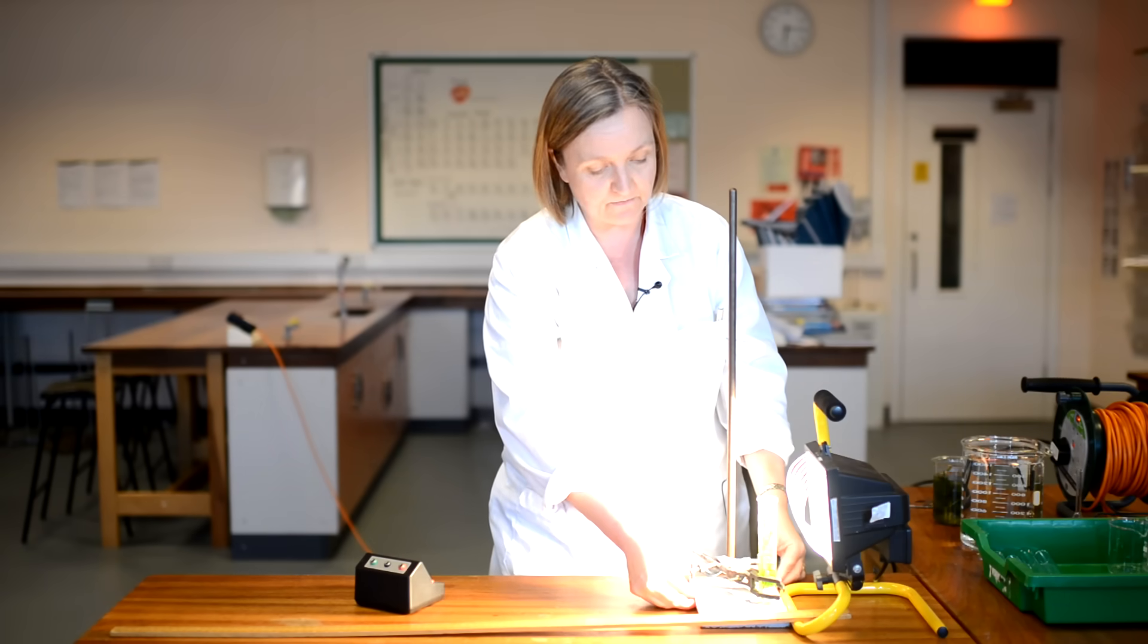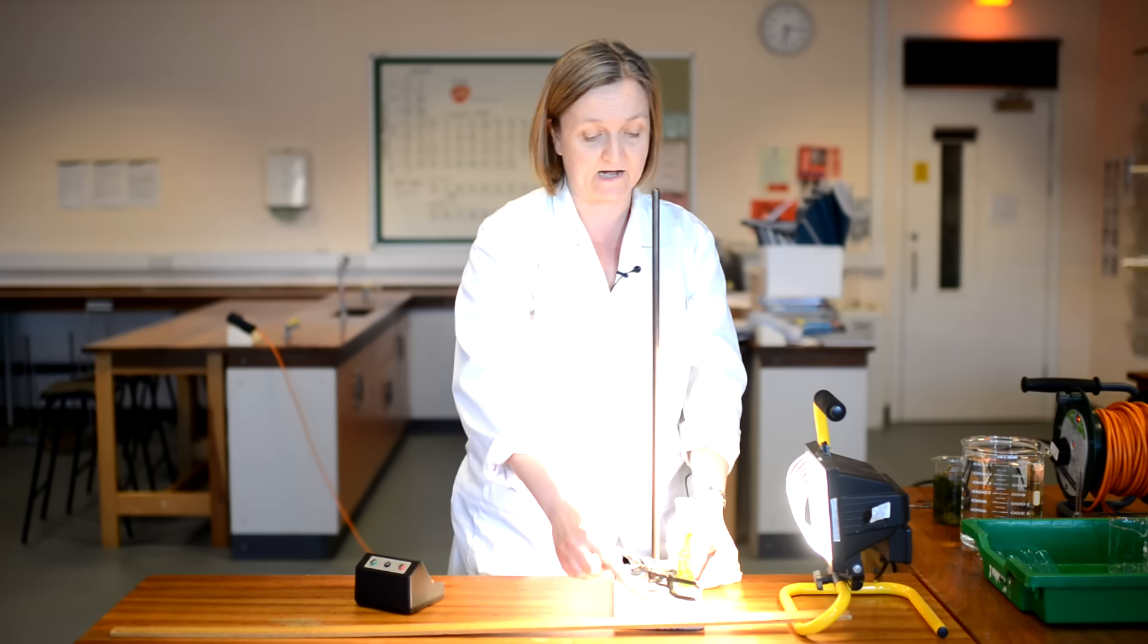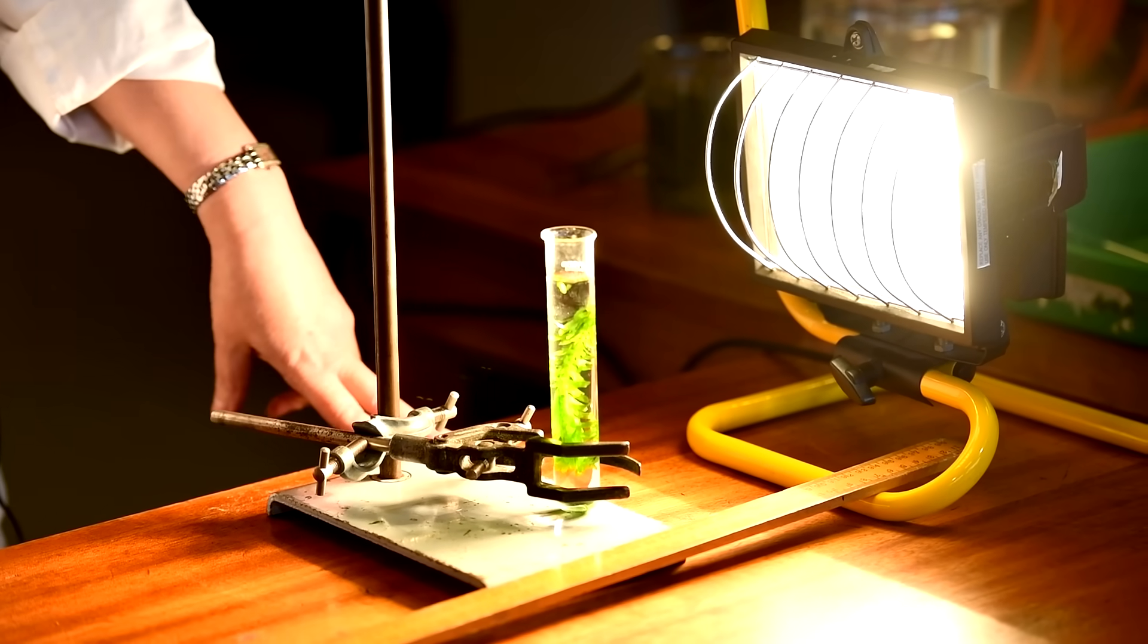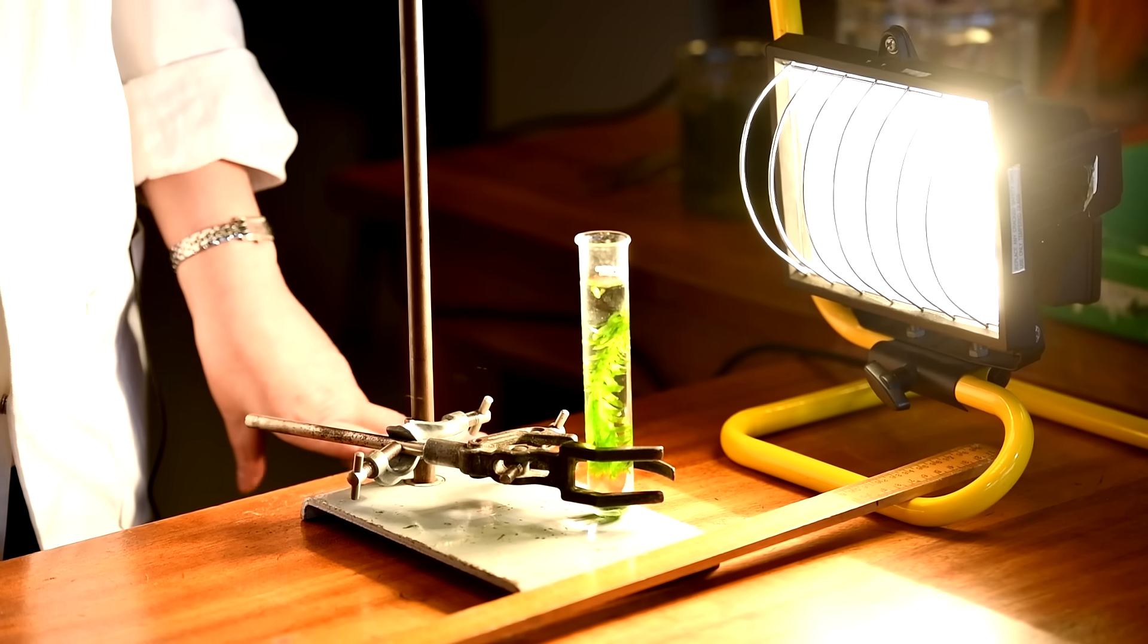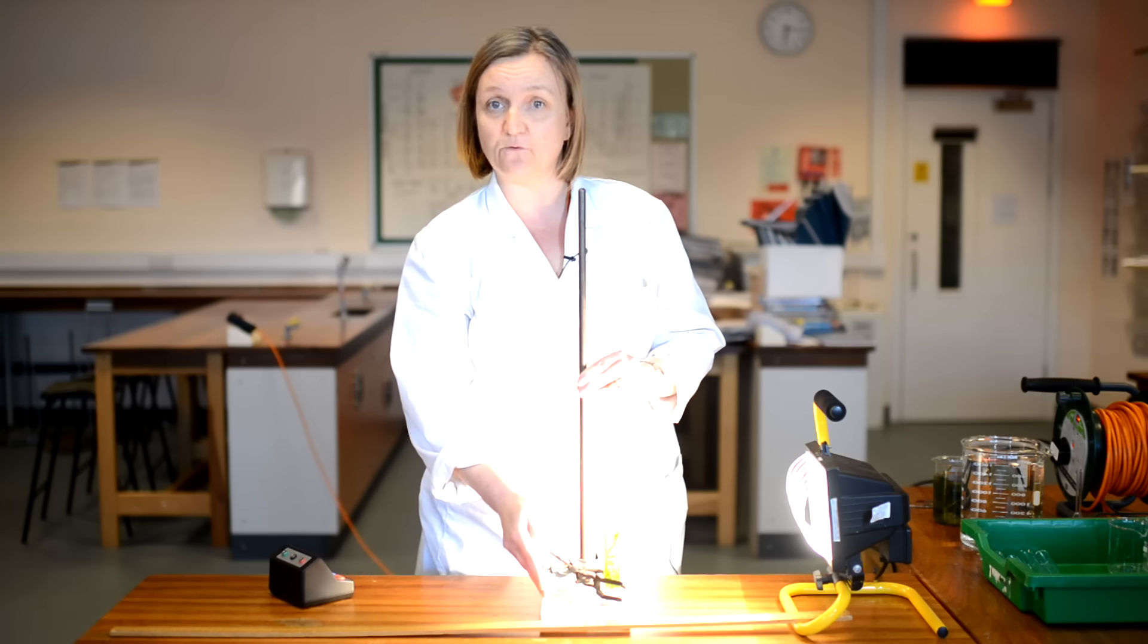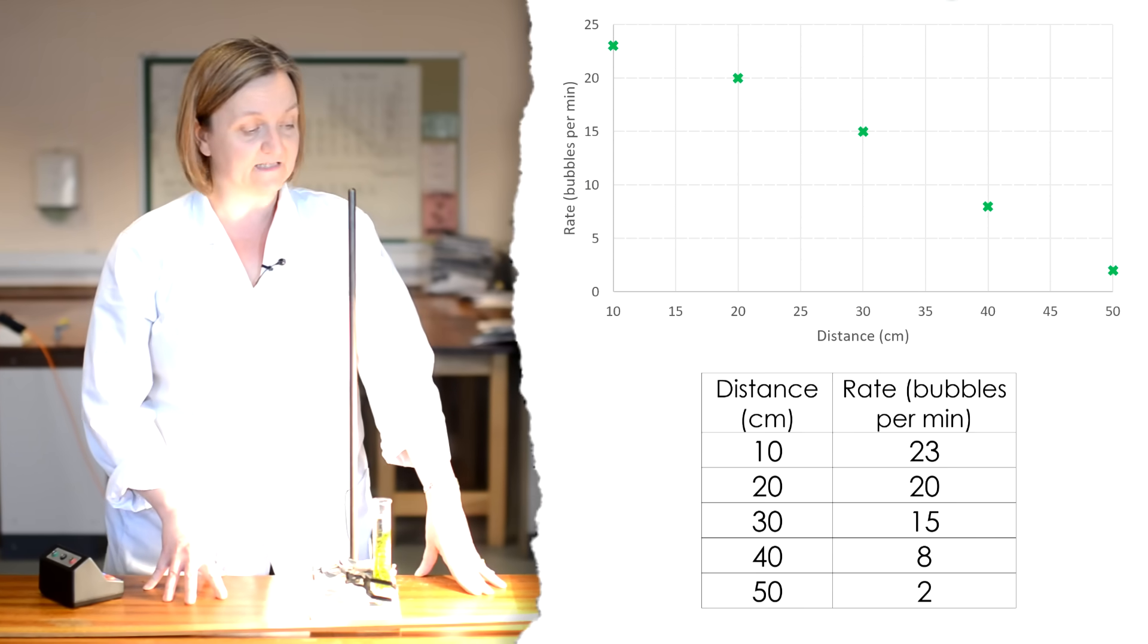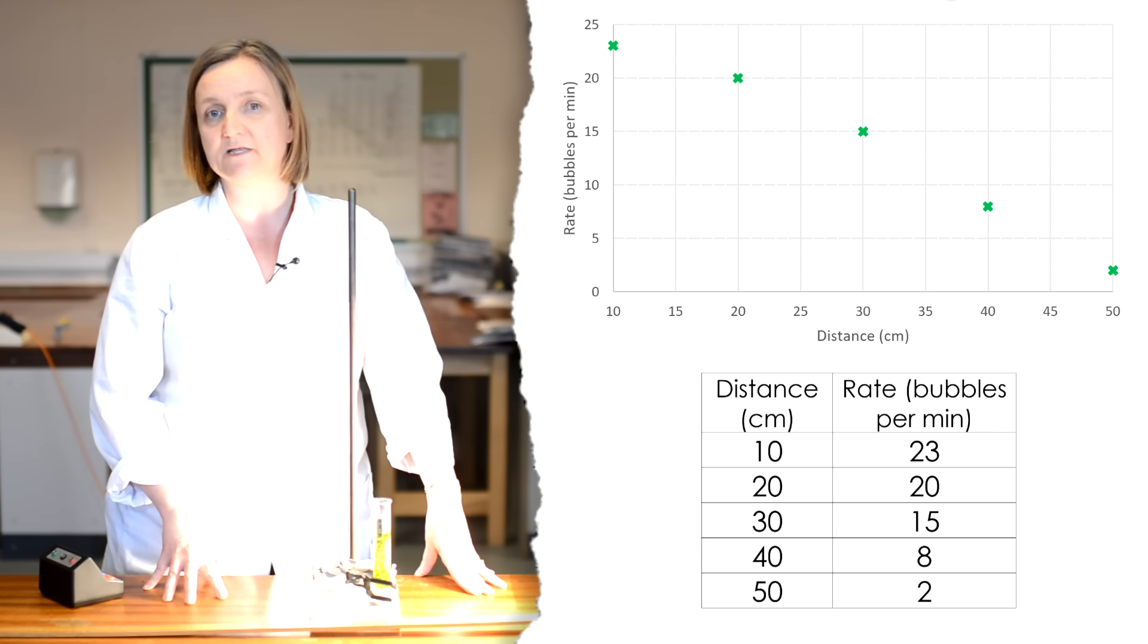So now I'm ready to change the value for our independent variable. So I'm going to move my pond weed away from my light so that it is now 20 centimetres from the light source. And again, as I did before, I'm going to leave it for a few minutes so it can adjust to the new level of light and then I will count the bubbles again. Now I need to do five values for my independent variables. So I'll repeat the experiment with the pond weed at 30, then 40 and finally 50 centimetres away from the light source. And so your results will look a little bit like this. And as you can see, as the distance between the light source and the pond weed got greater, the number of bubbles produced in a minute decreased.